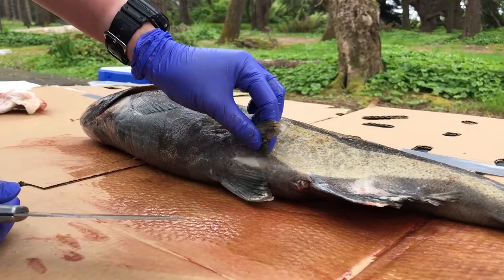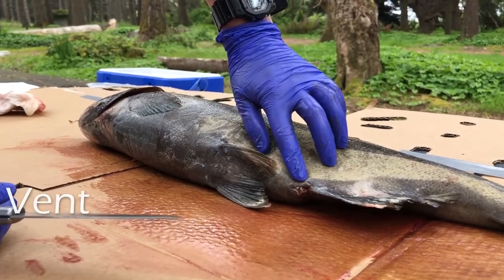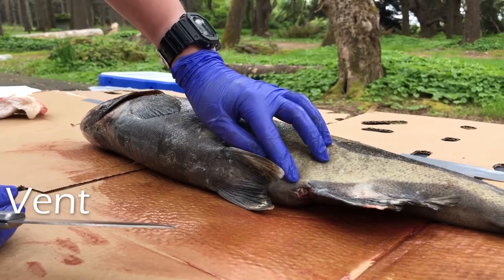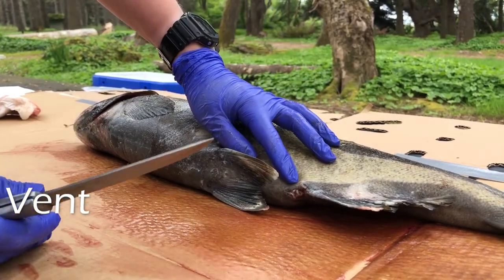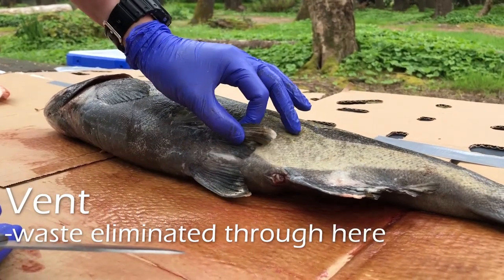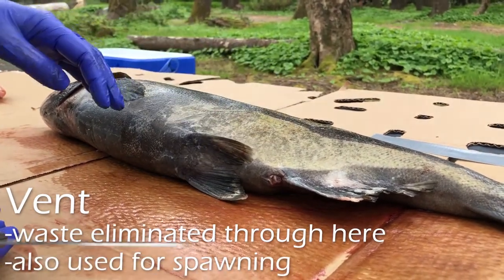I'm going to start at the vent, which is down here. It's also called the urogenital opening. This is where fish excrete their waste from, and it is also where females will lay their eggs and where males will fertilize the eggs from.